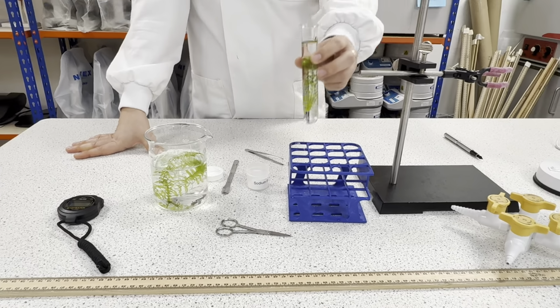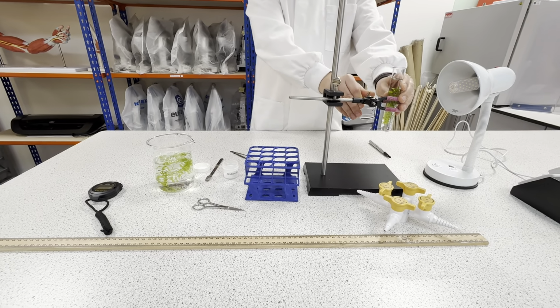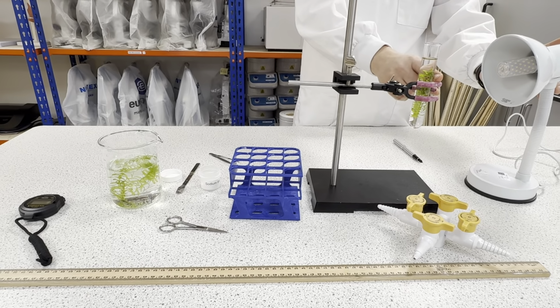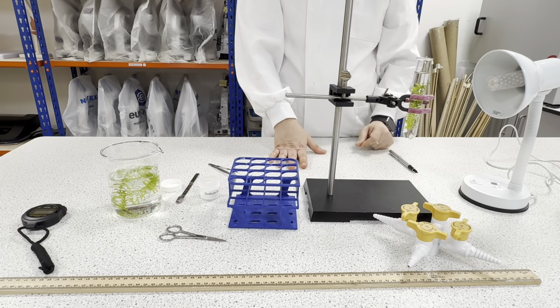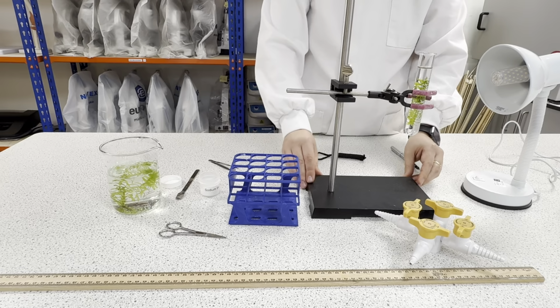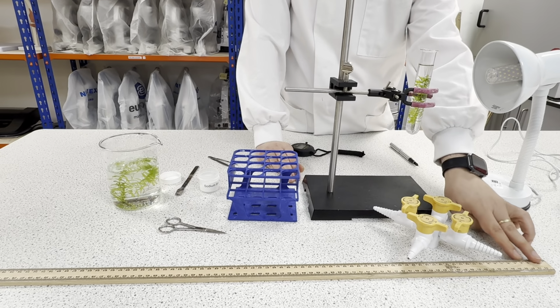Okay? So now I will place it here in my clamp stand, always aligned with my lamp, and ideally with nothing blocking the light. And I will measure the distance between the light and the plant.